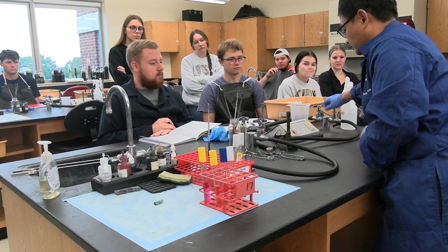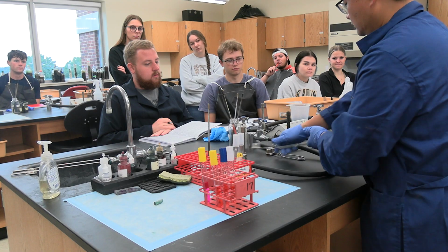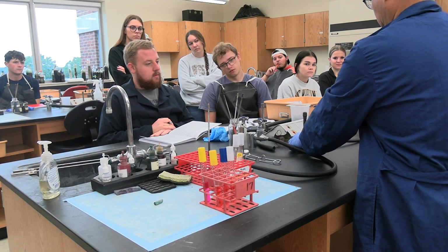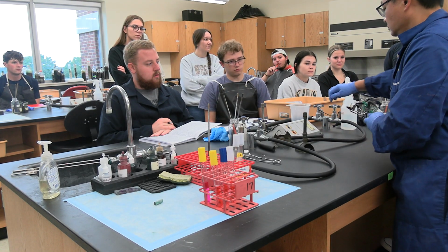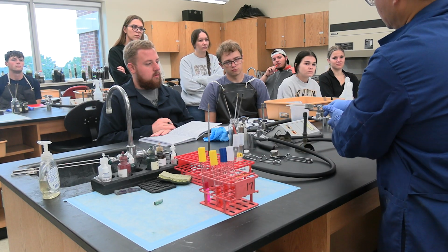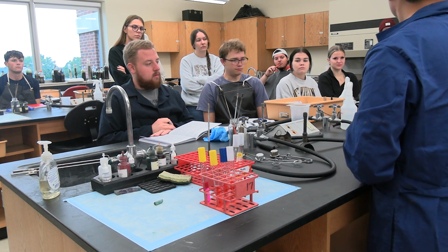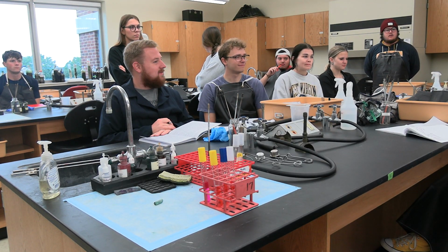This is good. Do you have gas today? No gas? No, we have gas. Hockey stick. Good, now.